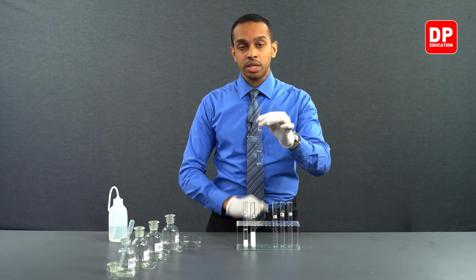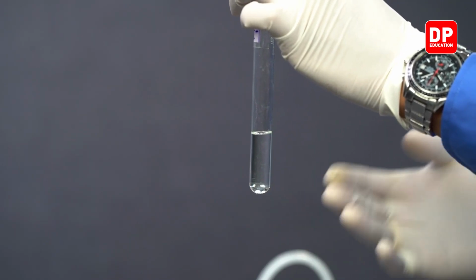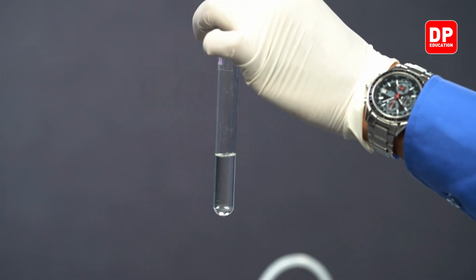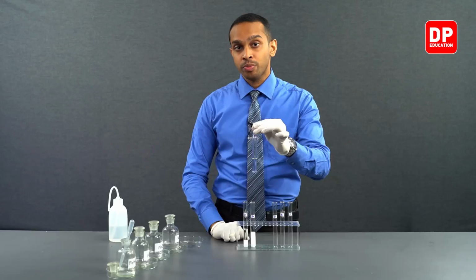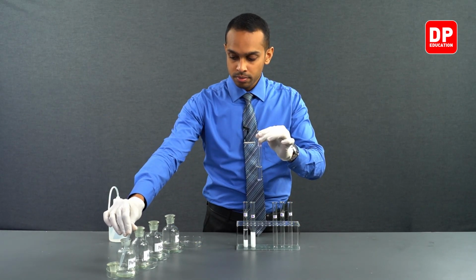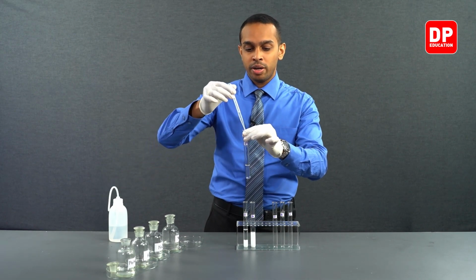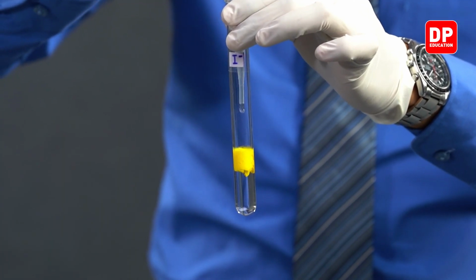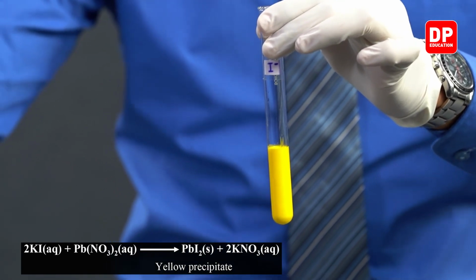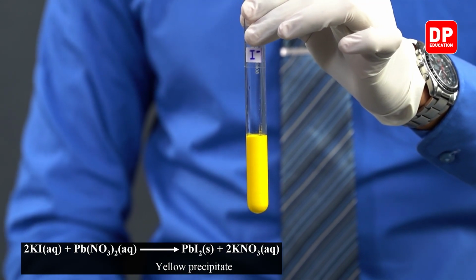Our main focus here is the iodide ions. As we saw, when iodide ions are added to lead nitrate, it will form lead iodide. Lead iodide is actually a very nice yellow color precipitate, which is formed instantly when you add lead nitrate into this.